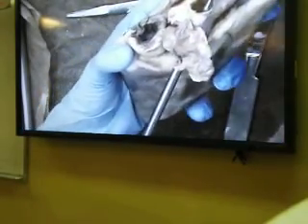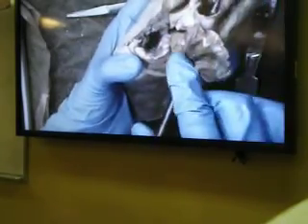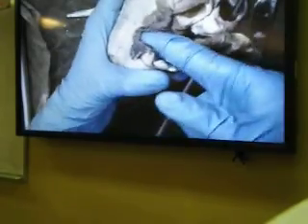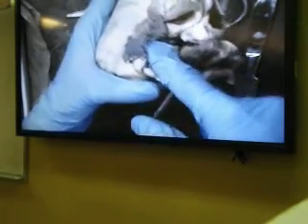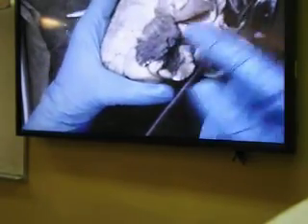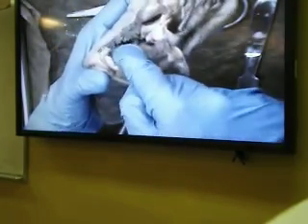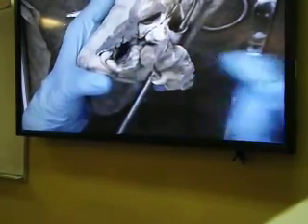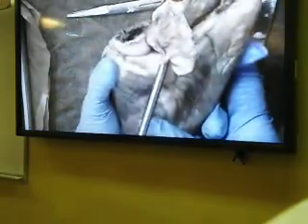So in this case, and in most of the sheep hearts that you will look at, the pulmonary veins are cut very short. So you only have one hole for the pulmonary veins. Some of you may see more than one hole, going to the left atrium, but most of you will be seeing just one hole going to the left atrium, and this hole is the pulmonary vein. This is cut very short, you cannot see four.